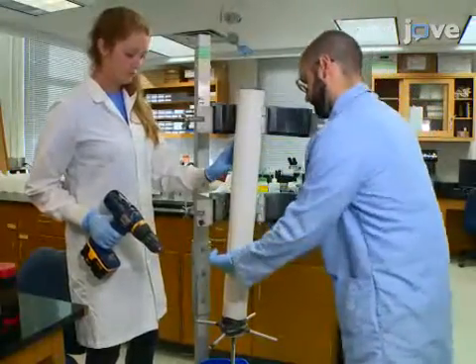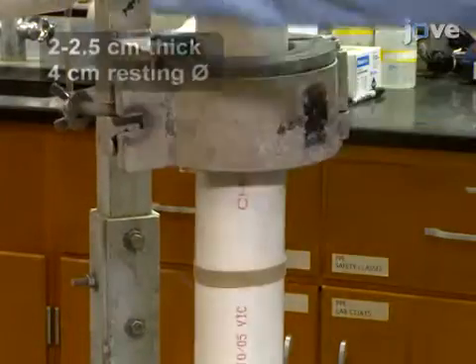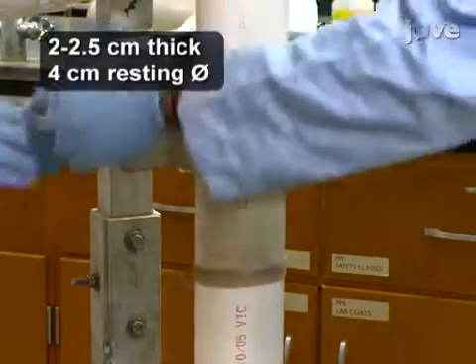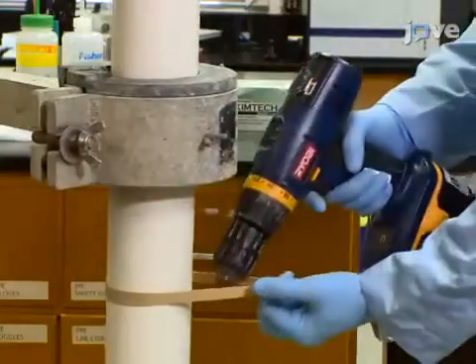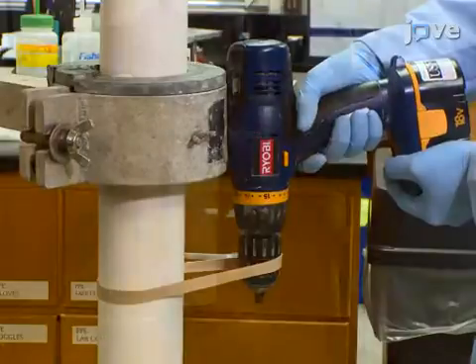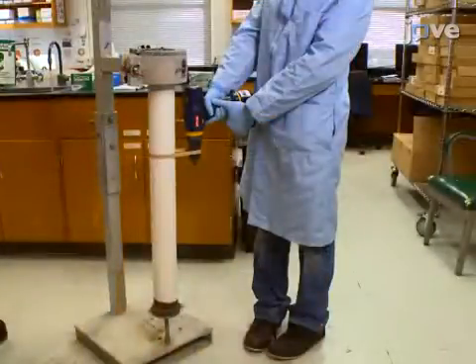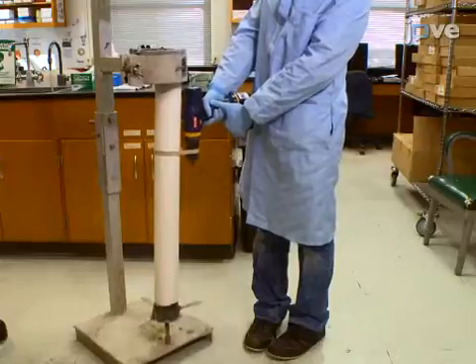After all the samples are collected, reset the extruder. Place a rubber band around the piston near its base for the most stability. Then stretch the rubber band around the head of a drill. Now rotate the piston using a low drill speed until it reaches the desired height above the base of the extruder.